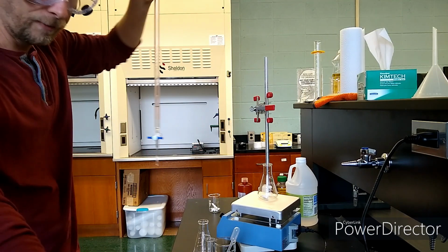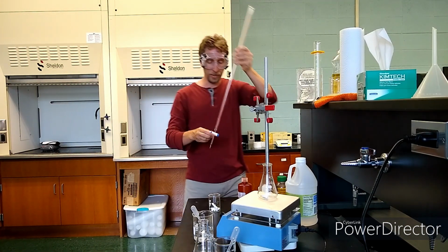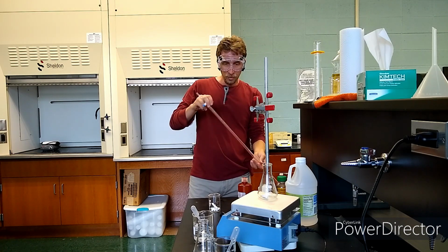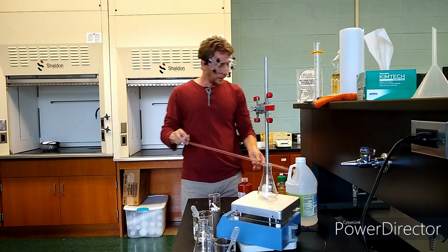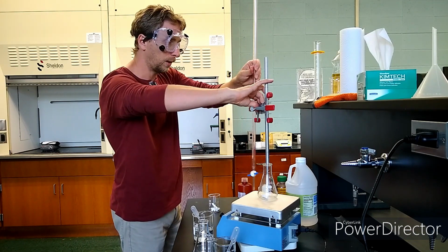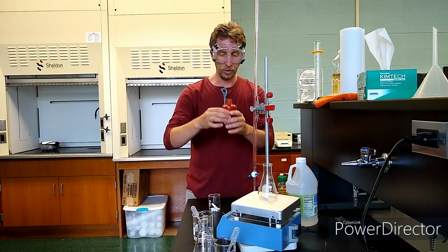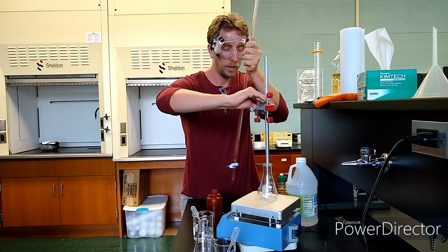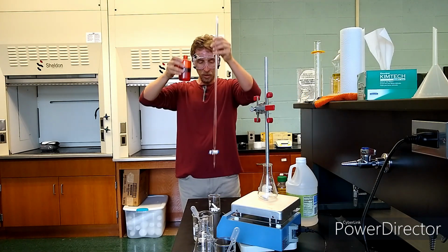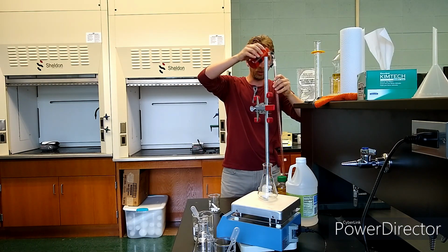So that counts as the first rinse for the burette. So I'm going to dump out the rest of that water. That was the aqueous rinse. And if you know the burette's not very dirty, then you don't have to do a lot of rinsing. The next thing to do is get the solution that you're going to fill the burette with and rinse it with that solution. So here's the iodine that we tested out earlier, and I'm just going to fill the burette up a small amount just to rinse the inside of the burette with this iodine solution.